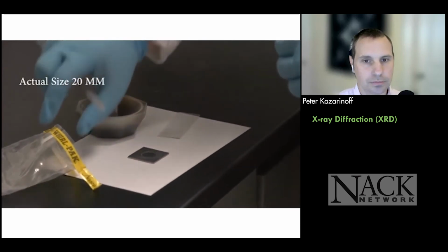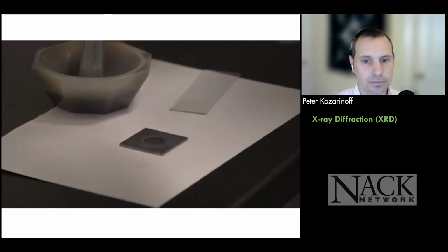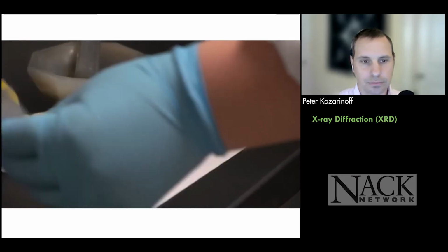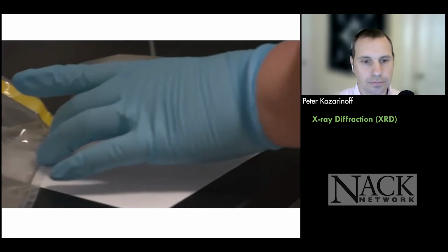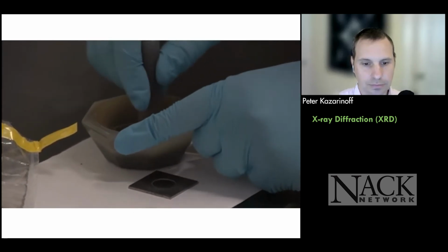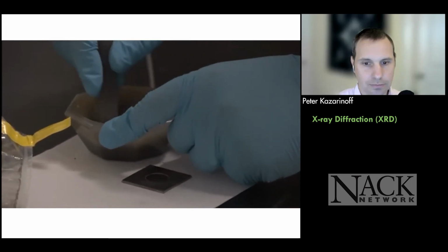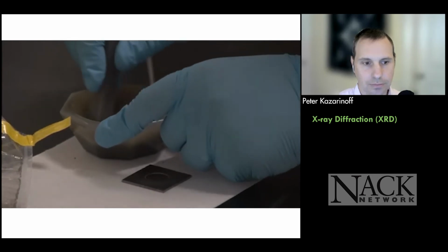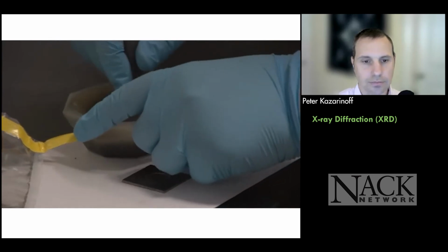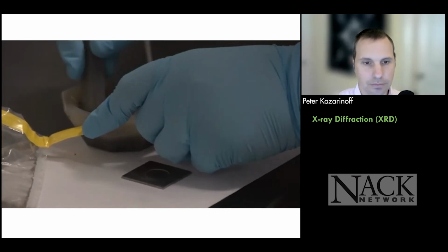What I'm going to do is take a little bit of powdered material. This has already been roughly ground. I'm going to grind it just a little bit more using a mortar and pestle, just to take out any sort of agglomeration that might be present. For the purpose of this analysis, I would like my particle size to be on the order of about 40 to 45 micron.